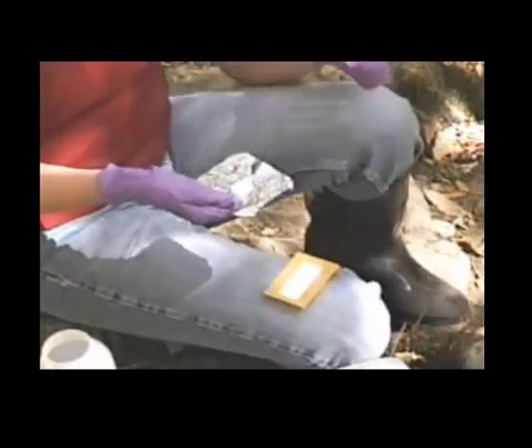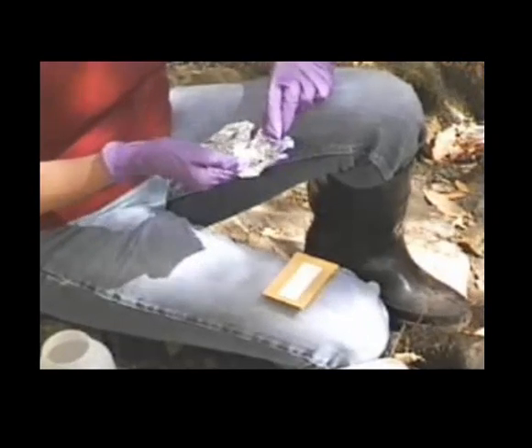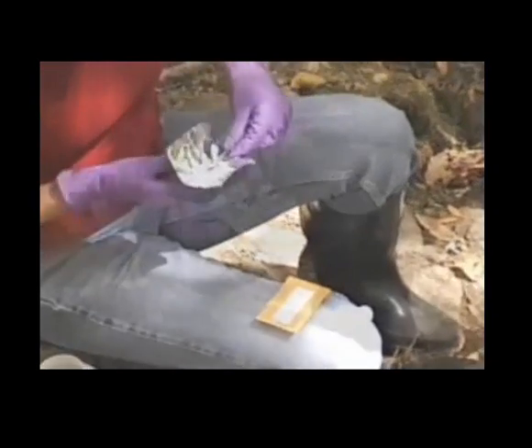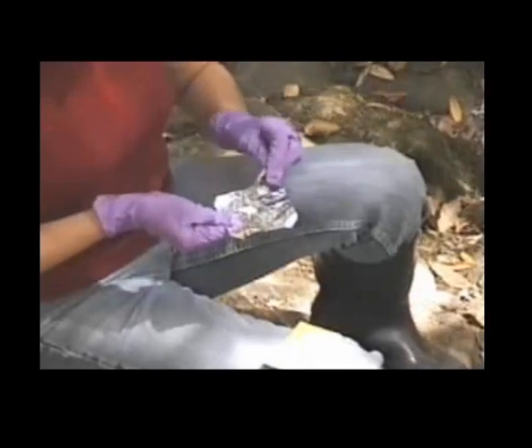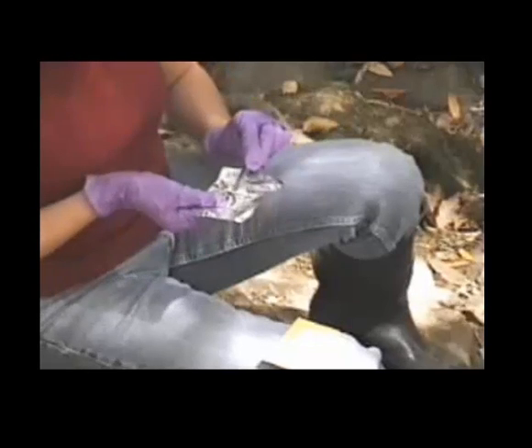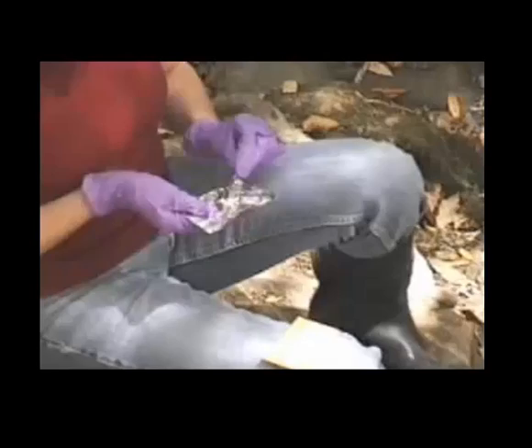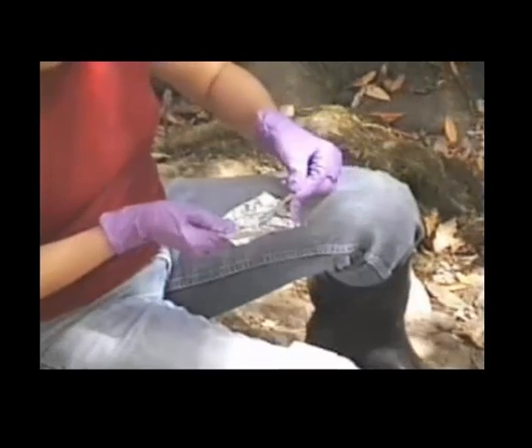And the filter needs to be folded into quarters. And you want to be careful when you're doing it not to squeeze all the water out of the filter.